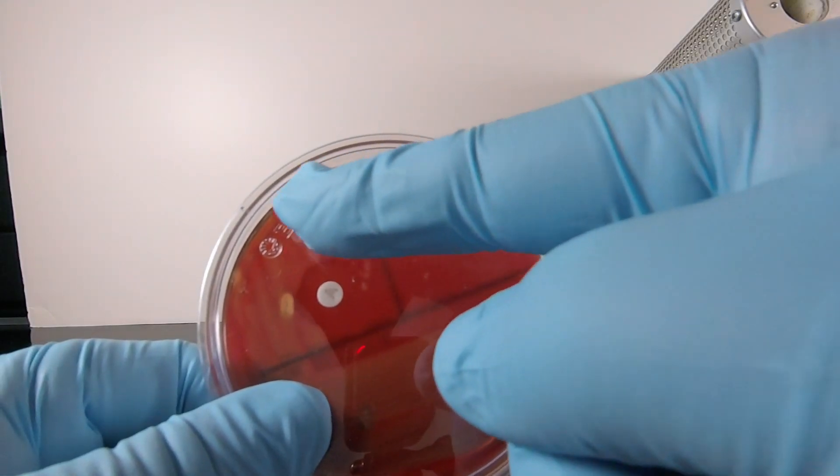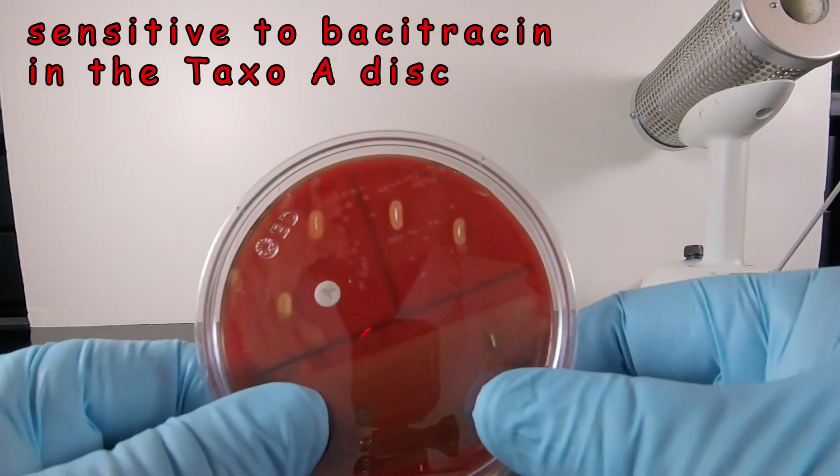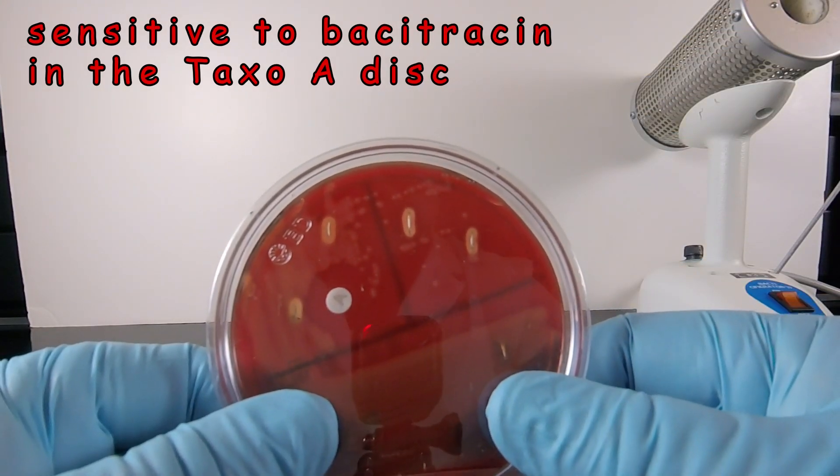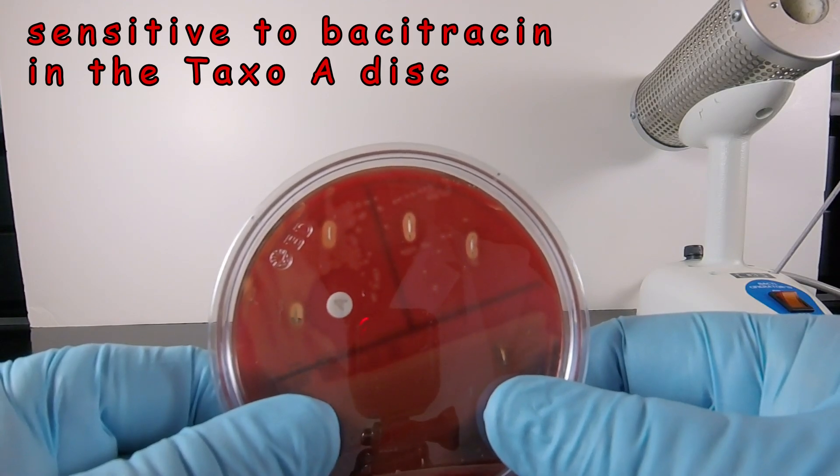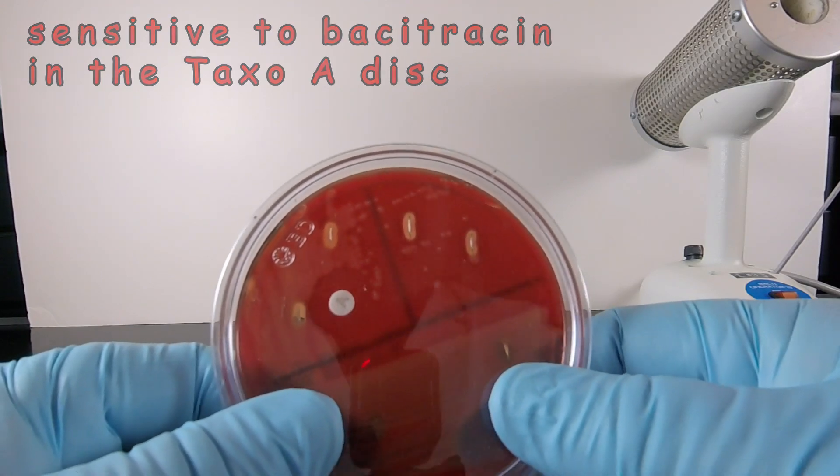And finally, we see a zone of inhibition around the Taxo A disk containing bacitracin, showing the bacterium is sensitive to the A disk or is inhibited by bacitracin.